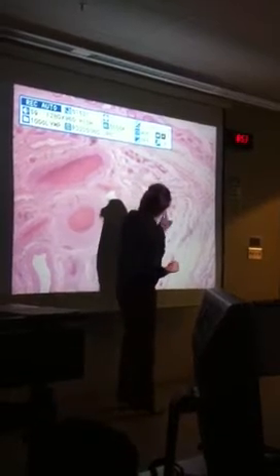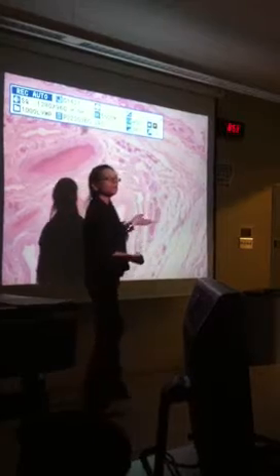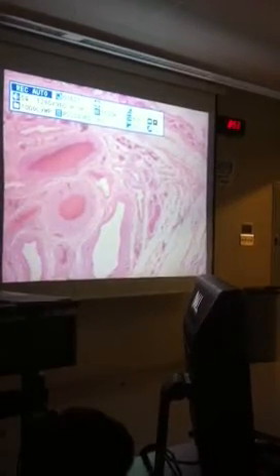and your nerves are going to be these guys right here. They're going to be smaller circles that are just solid, and they don't have a lumen in them.